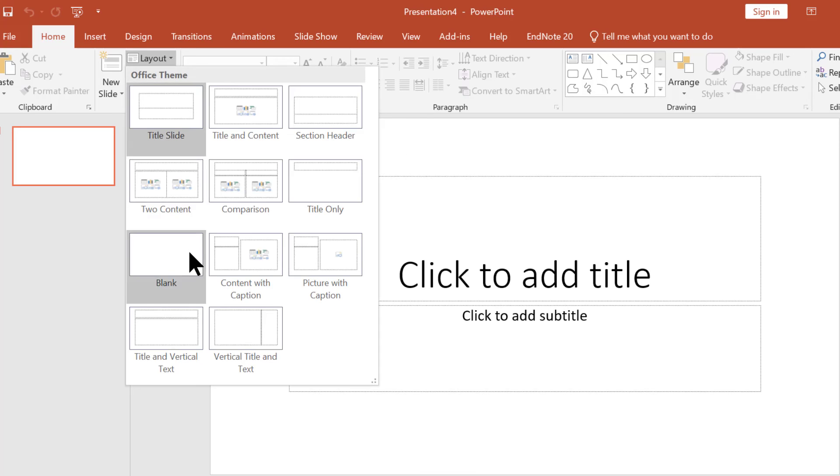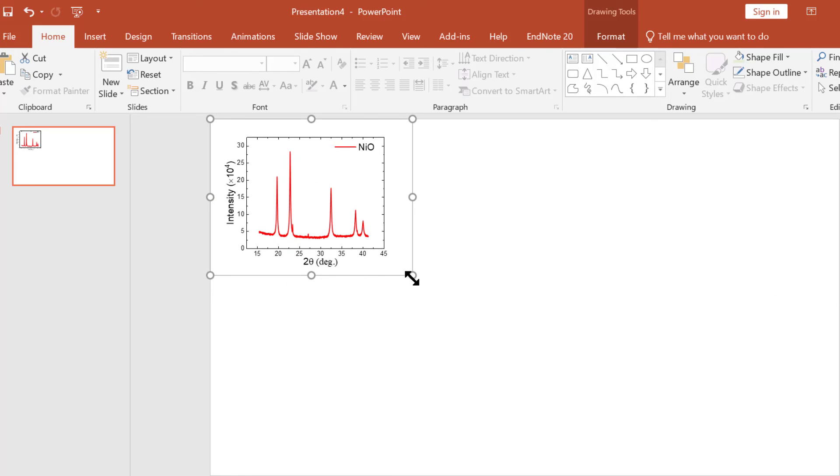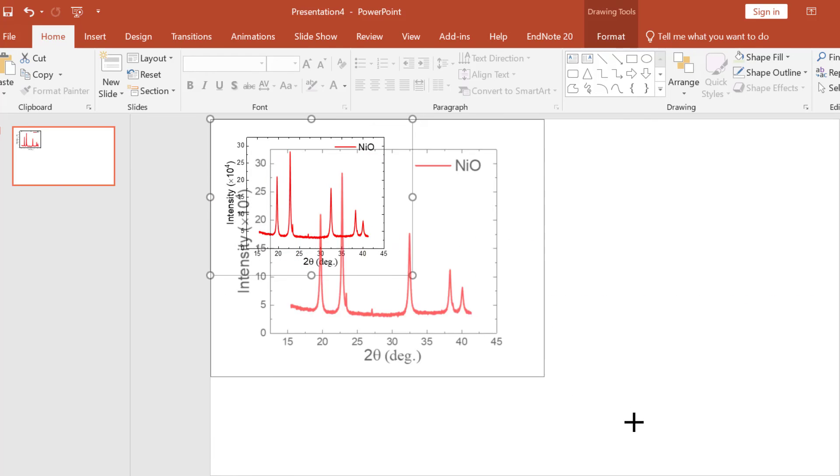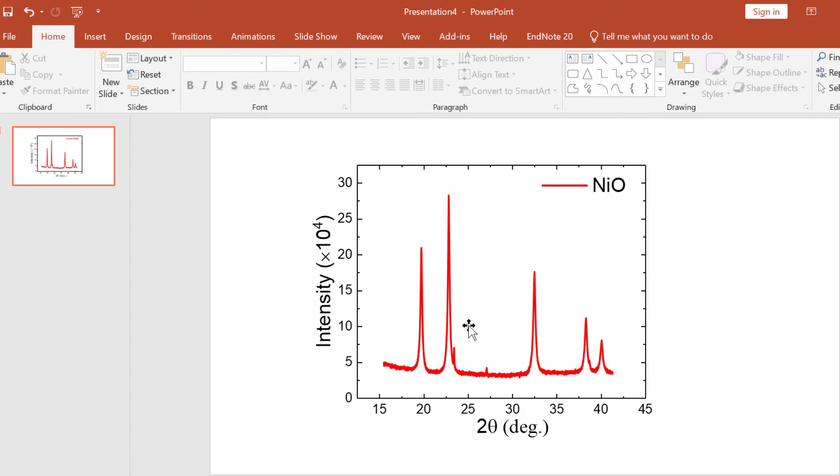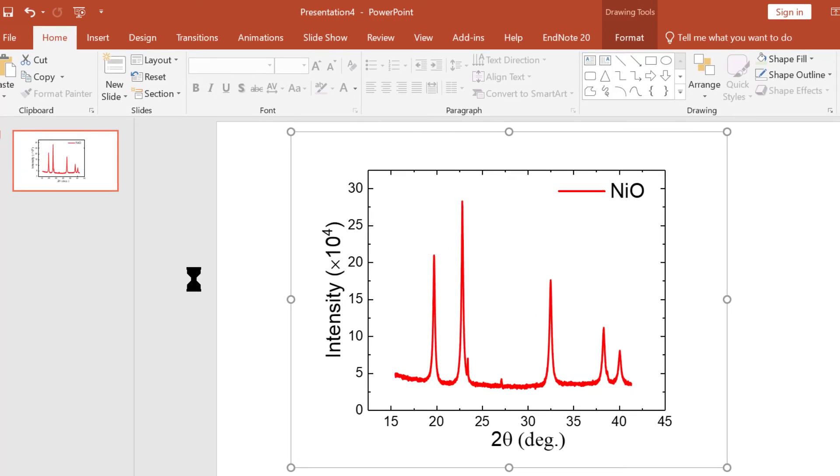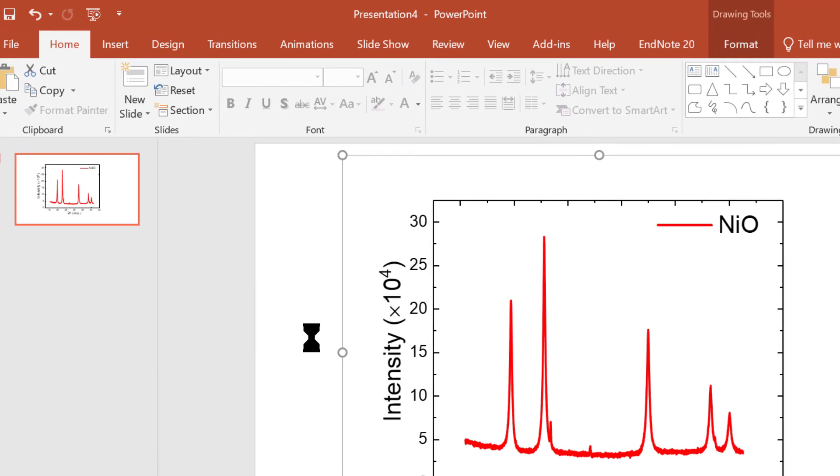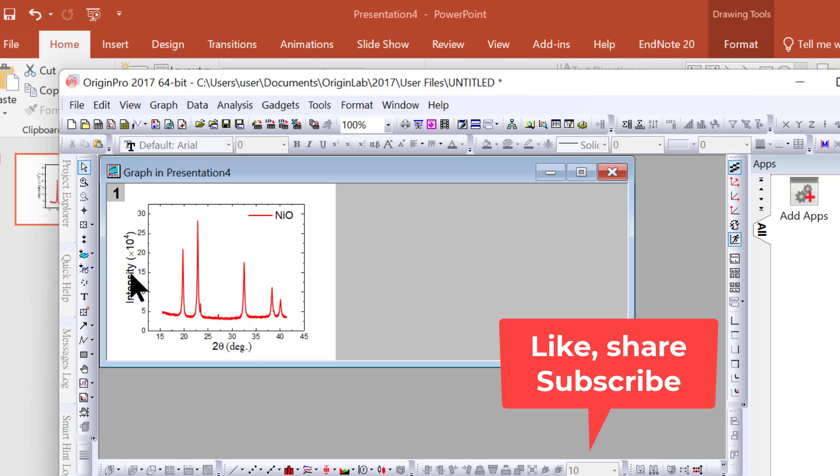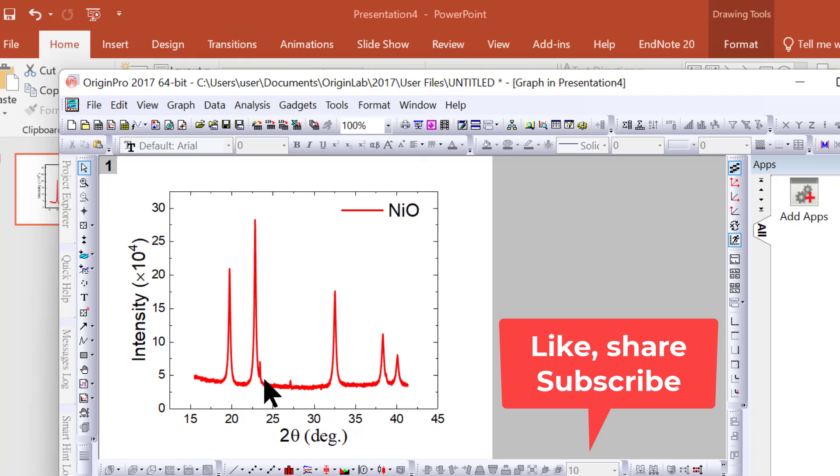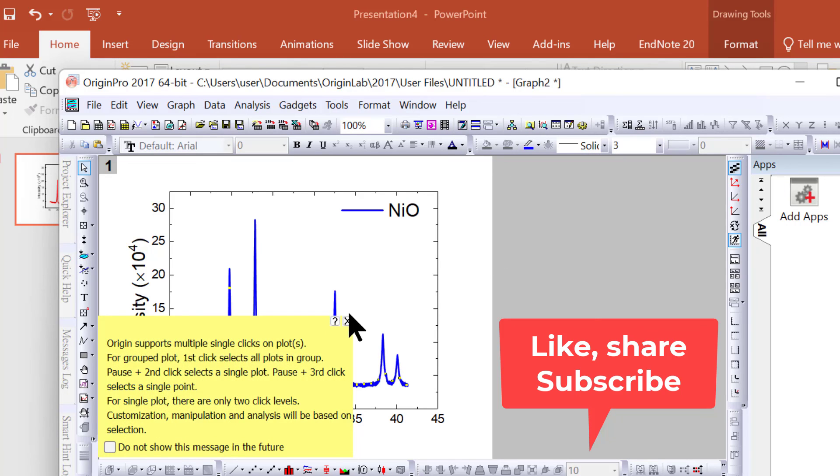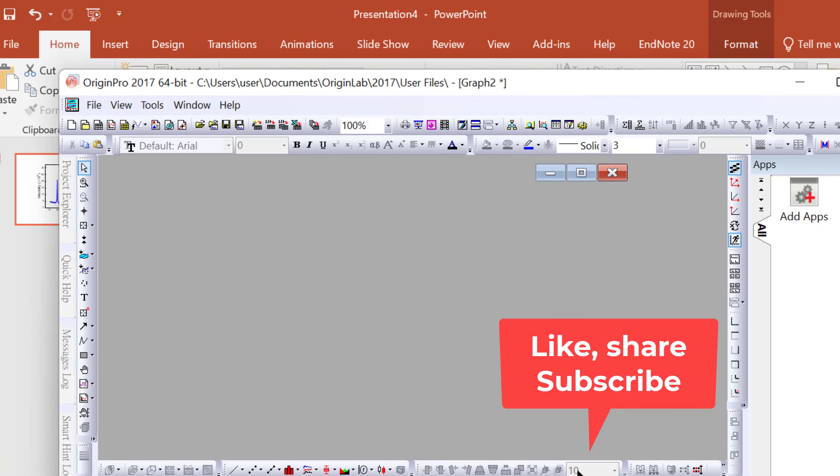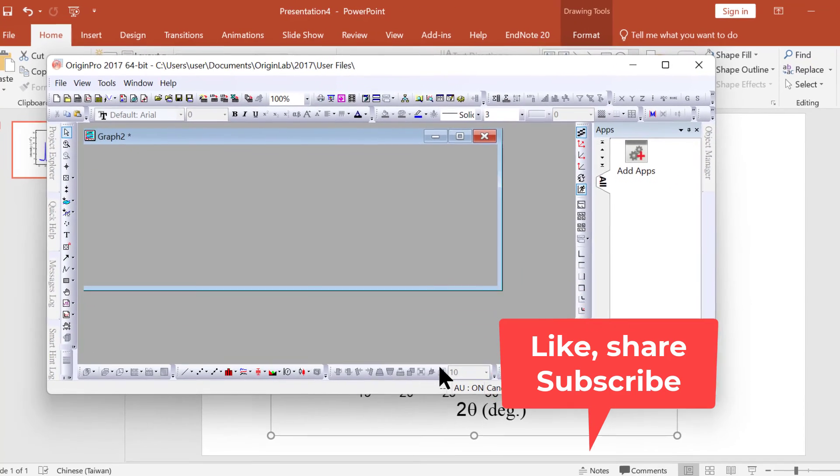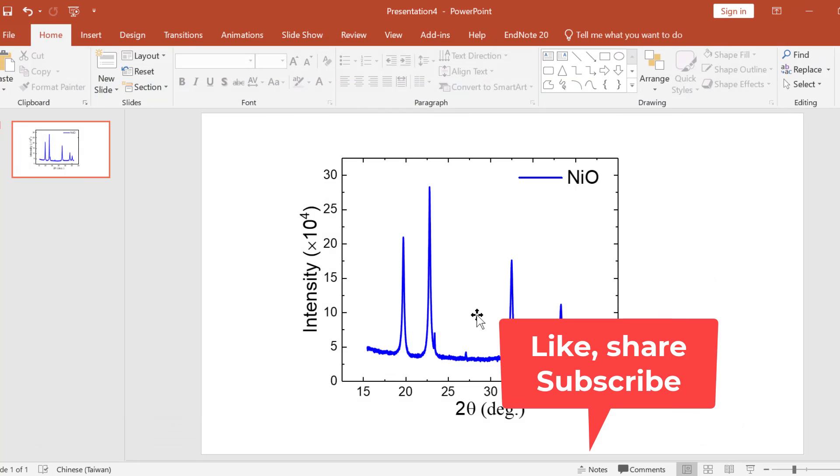This is your XRD spectra. Suppose in the future you want to make changes. You can double-click on the spectra and it will automatically open in Origin software. Once it opens, you can make modifications. For example, I'll change this color to blue. Just close it, and it will automatically get updated.